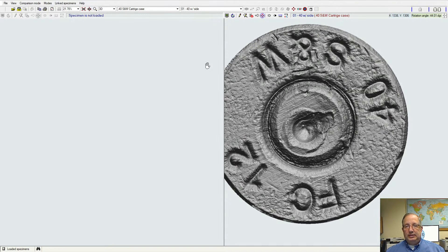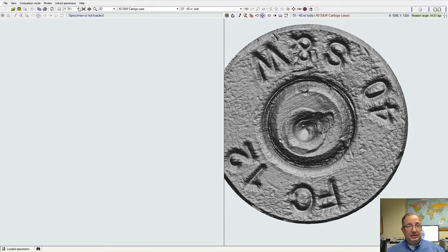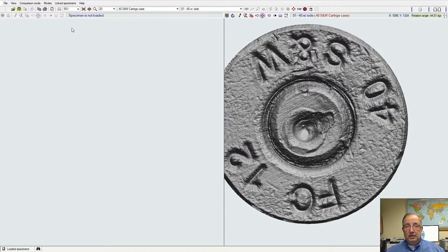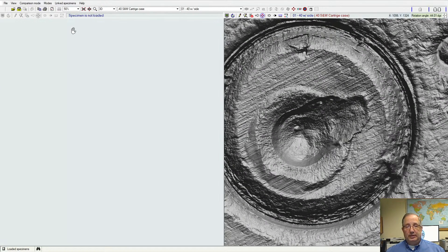With these imaging controls for both the side and the face of the cartridge case, just to give you a quick introduction, we can change the magnification of the sample that we're looking at, so we can zoom in or zoom out on the image for more detail.